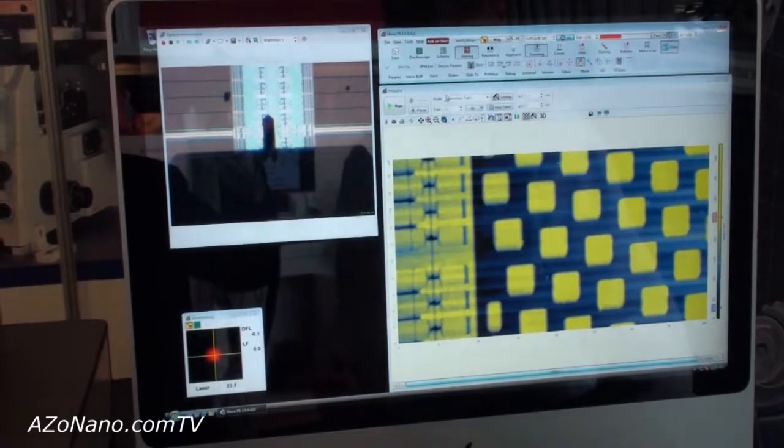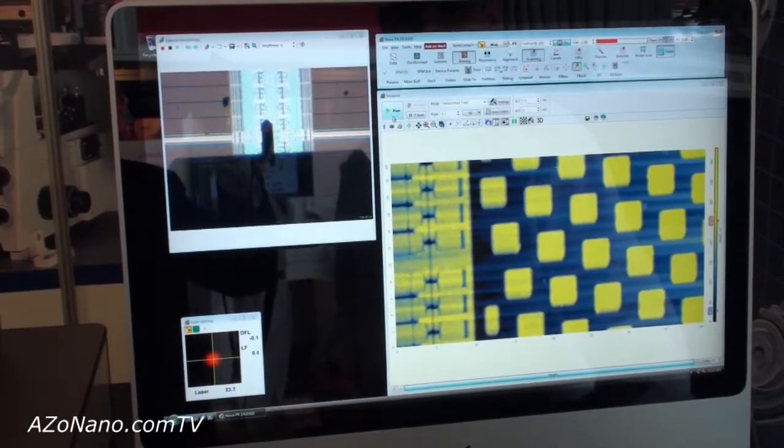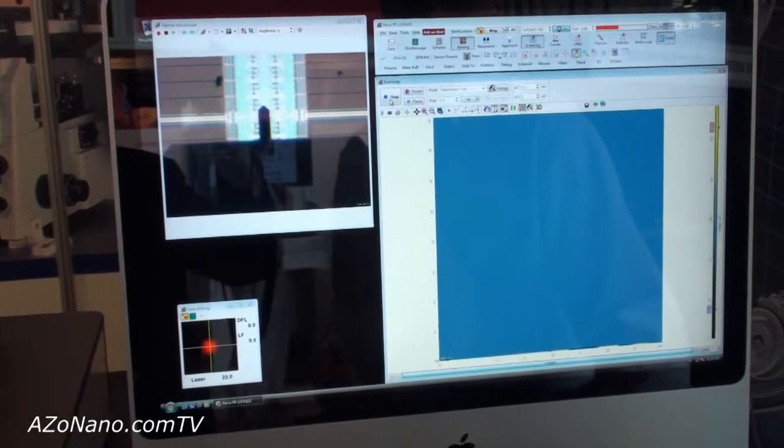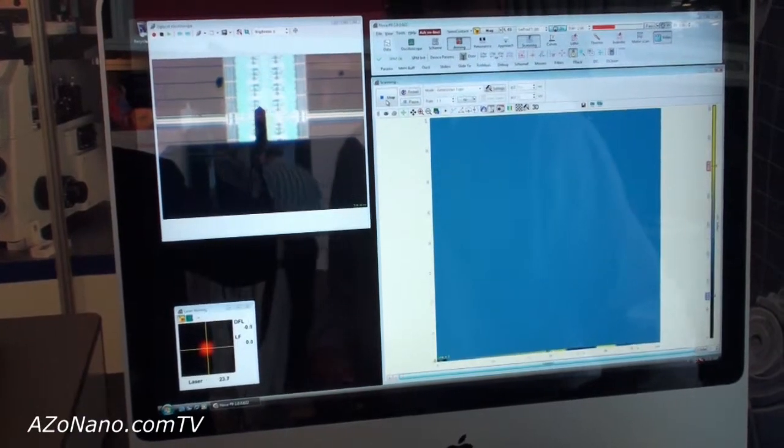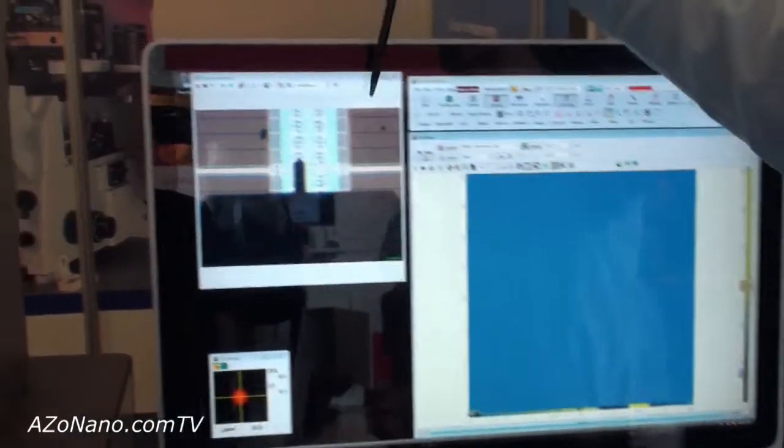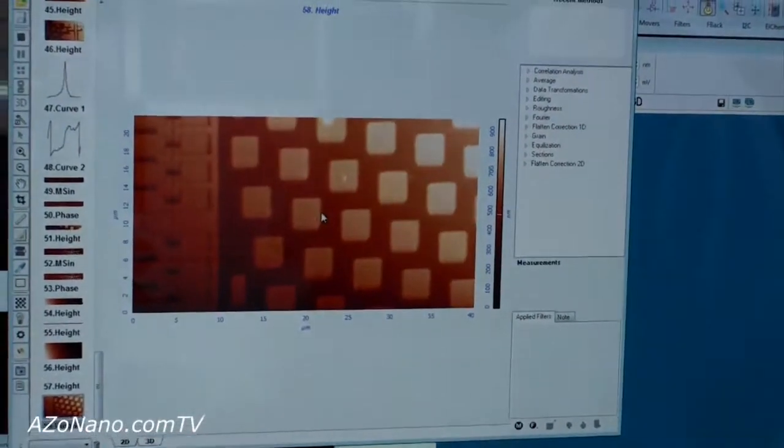Approach done, and we can start scanning. In the optical image you can view the sample moving under the tip, making the raster scanning. Line by line the image appears, so when it's done we get a 2D image, for example like this one.